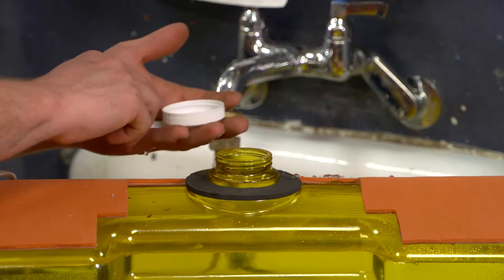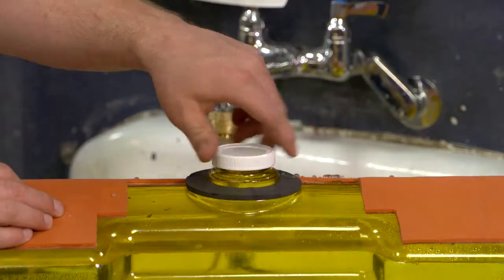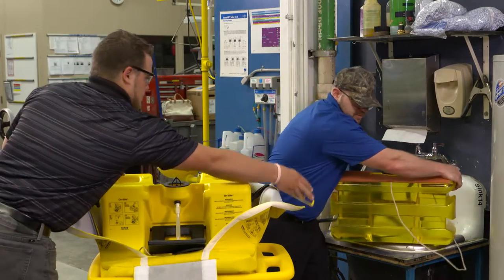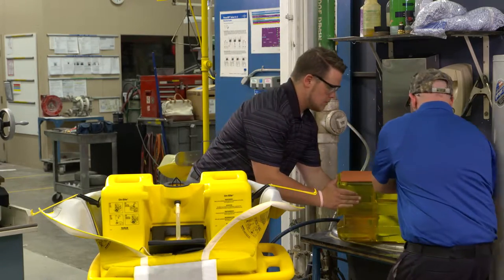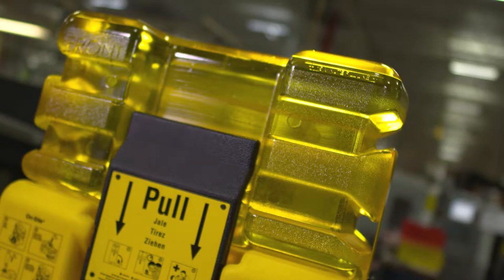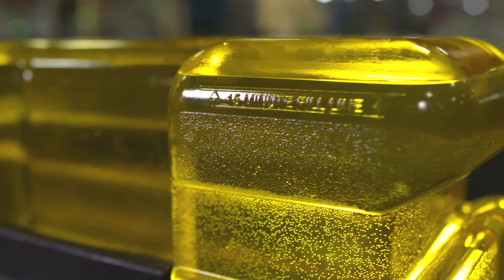Insert one liner into the cap with the hole and attach to the top of the tank. You are now ready to mount the tank on the pedestal. The tank weighs 60 pounds when filled with water, so assistance from another individual is required. Mishandling the tank can lead to small hairline cracks that may not be noticeable right away, but over time the cracks will expand causing the tank to leak.